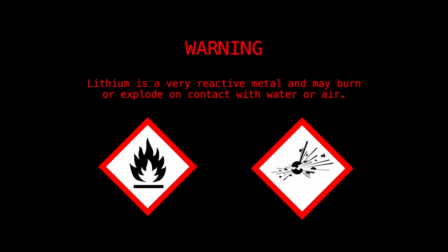Warning: lithium is a very reactive metal and may burn or explode on contact with water or air.